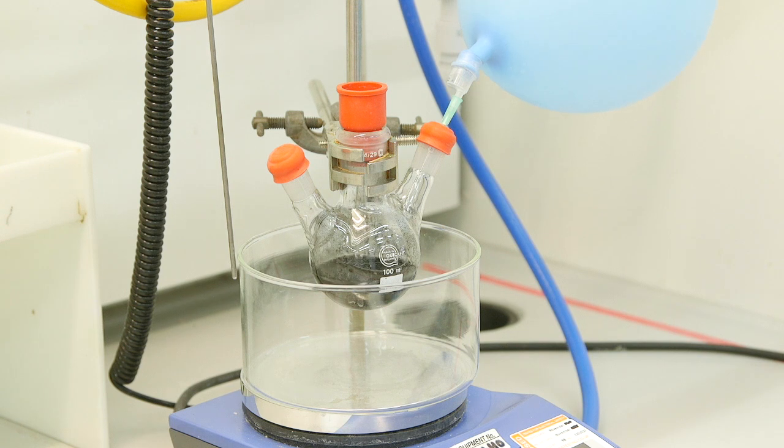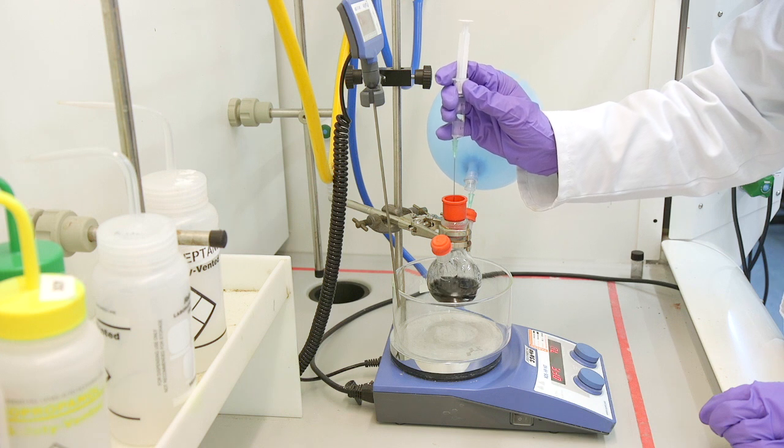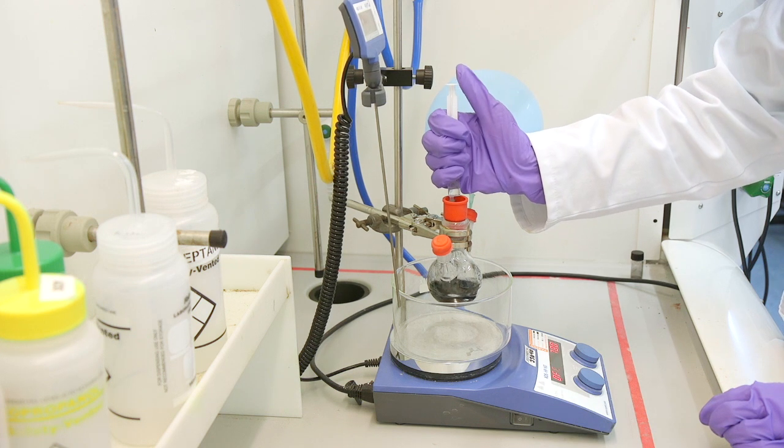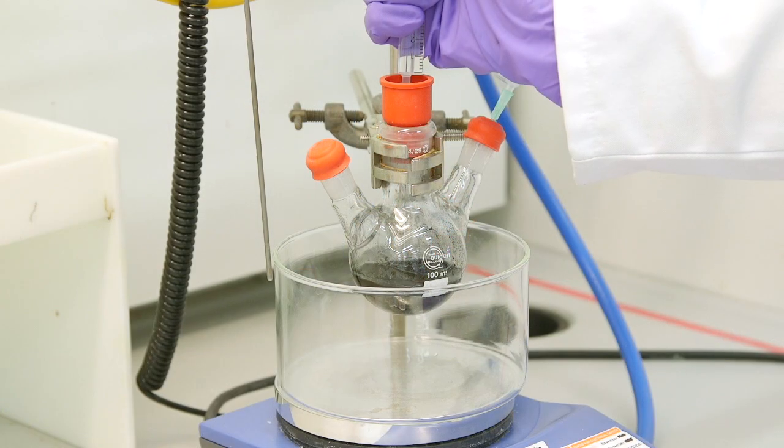It is now at this stage we can add our substrate or starting material. This has been pre-dissolved in ethanol. We can use a needle and syringe to do this to ensure we keep a dry atmosphere inside the flask.